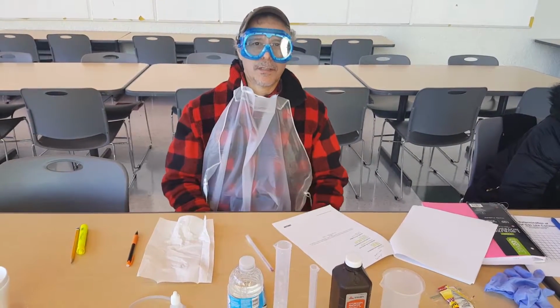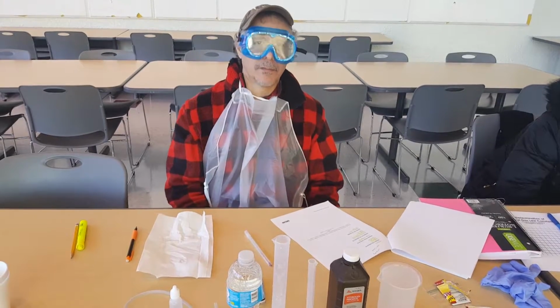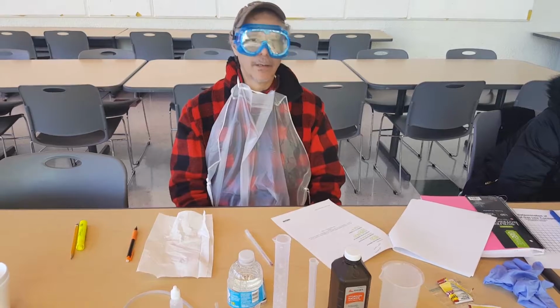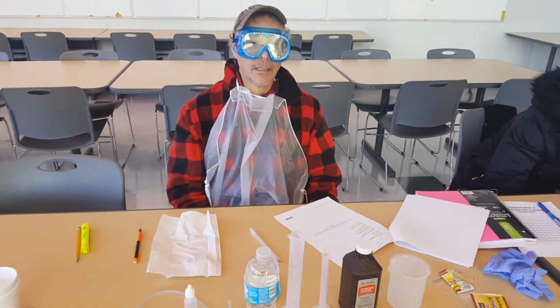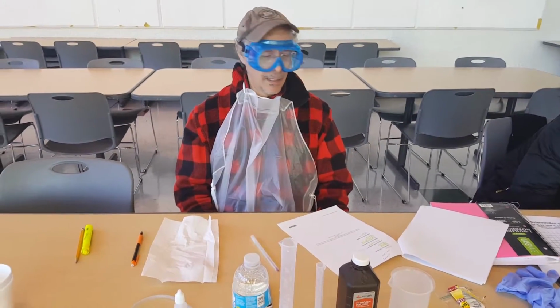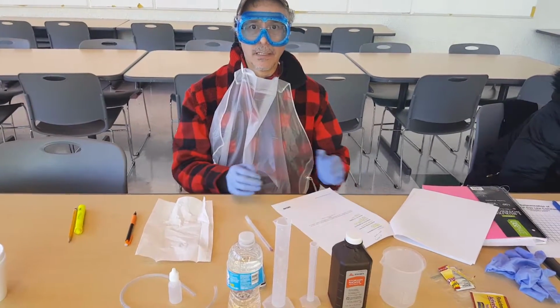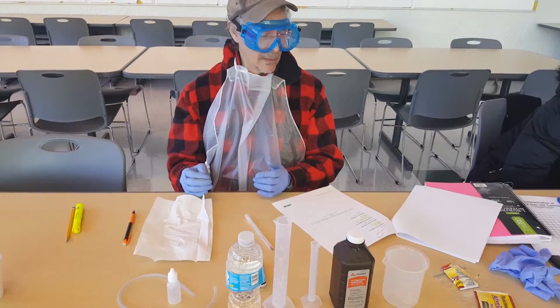My name is Joel Castillo for Chemistry 1411. Dr. Fox, our instructor leader. I'm here conducting lab number 10, activity number 1. And first, I want to make sure we cover all the material that's needed in conducting this experiment.